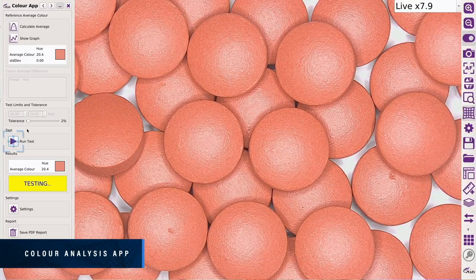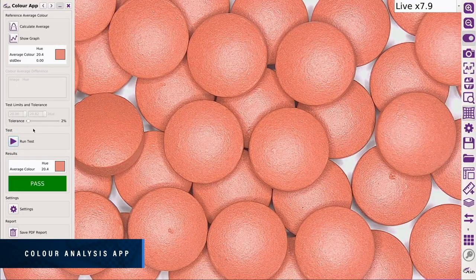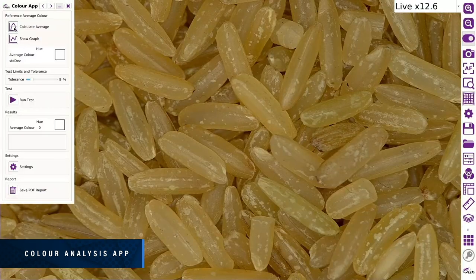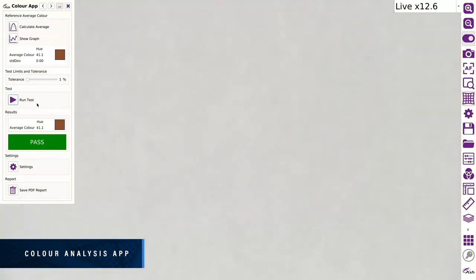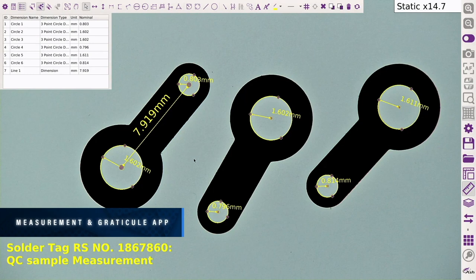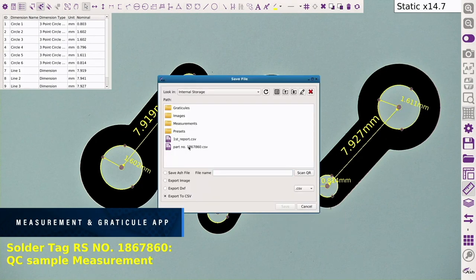Identify contaminants or foreign objects using the Color Analysis app. Improve yield by up to 100% while reducing costly overheads. A full suite of accurate measurement tools is available to efficiently carry out any measurement tasks.